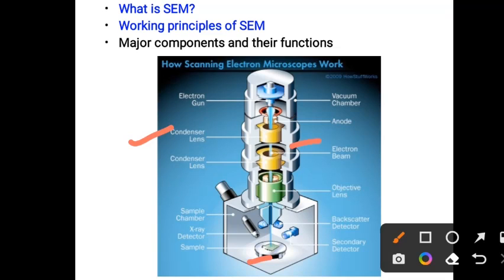In general, the most basic SEM is equipped with a detector for identifying the secondary electron signals and the image of the surface. At last, these signals are given to the computer for displaying the image using the electron signals received by the detector, which provides the interface between the SEM and the operator.